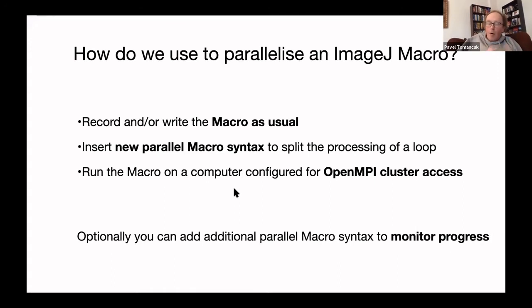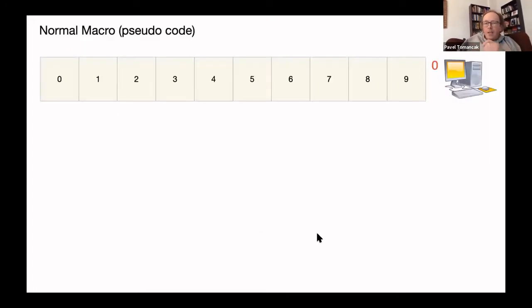What is a little bit more complicated, and which I will try to show you as well, is that you could also insert a little bit of syntax to provide monitoring that something is happening, that your processes are actually progressing, and you can really decide at what pace you want to have this monitoring, or you just don't do it at all and trust that the cluster is going to do what you ask it to, which is a kind of tall order sometimes. Okay, so now let's see.